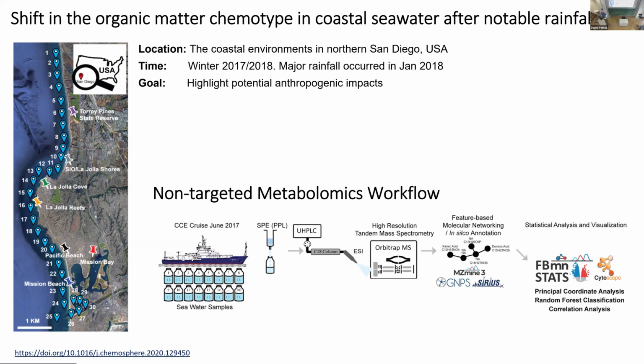Then we converted this to mzML files, and that is basically where all of you started processing this data, right? We used MZmine 3 with Stefan to pick the features, and then we used GNPS2 to create molecular networks and do the spectral library matching. And then with Marcus yesterday, you did the SIRIUS in silico annotation, right?